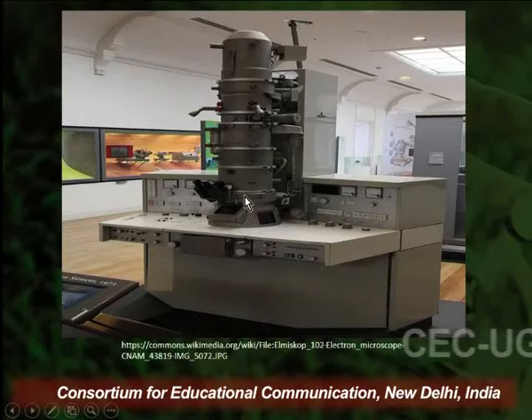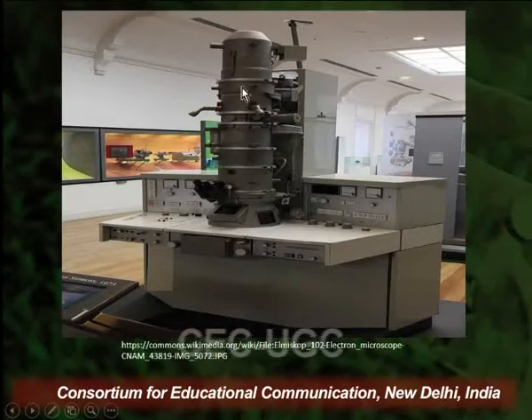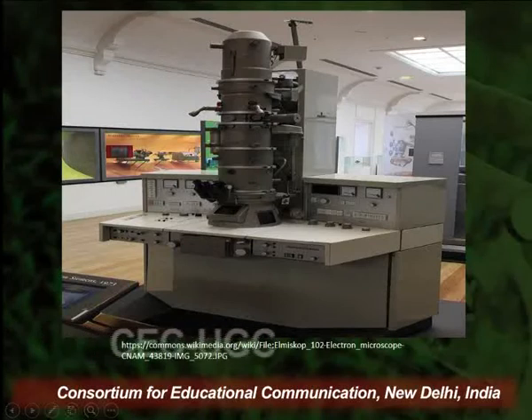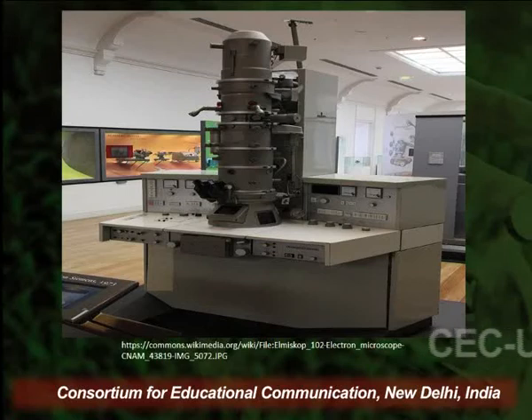And also, if you observe, it requires a great deal of preparation to just install, and the size also happens to be very huge. And this model has become refined over the period of time, but the basic principle of functioning of an electron microscope has remained the same.